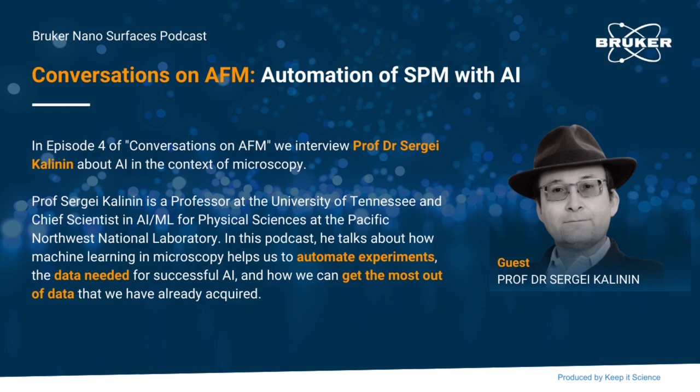We know that generally trained models, for example SAM by Meta, can be used as is, out of the box. We have some experience deploying SAM as a part of imaging workflows on automated electron microscopy. But these models solve a very limited set of tasks, for example image segmentation. So they can assist the human operator, but they are not making the decisions that a human operator normally does.